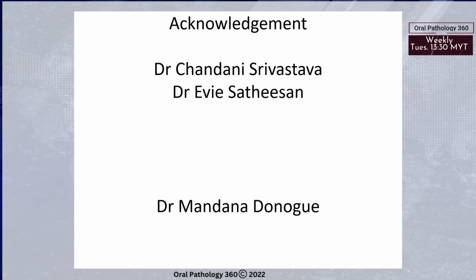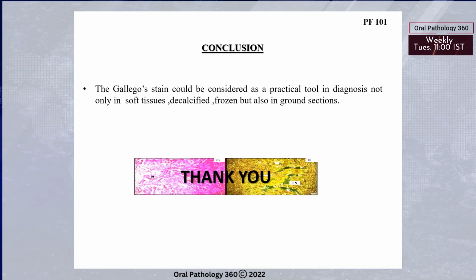And also, I would like to thank Mandana for giving us the opportunity, me and our senior lab technician, Dr. Rajeshri Tahale. So with this, I would like to conclude my presentation by saying that Gallego stain could be considered a practical tool in diagnosis, not only in soft tissue, decalcified, frozen, but also in ground sections. So with this, I would like to conclude and thank you so much.